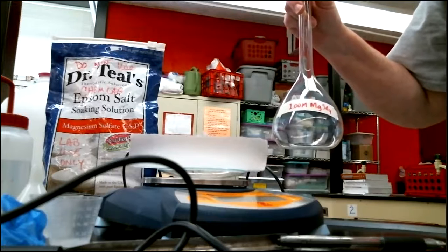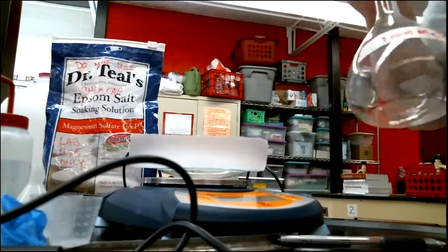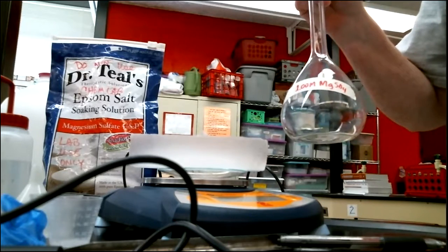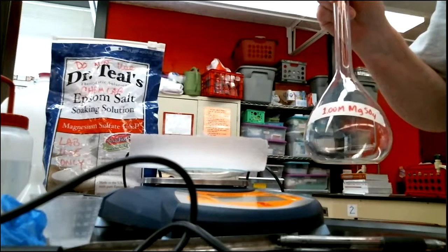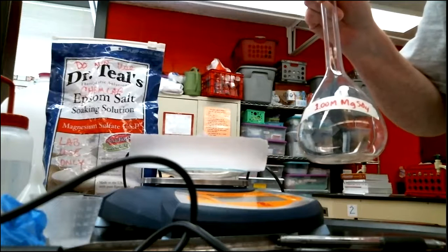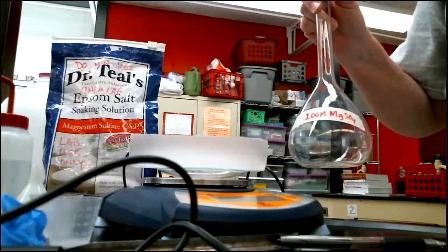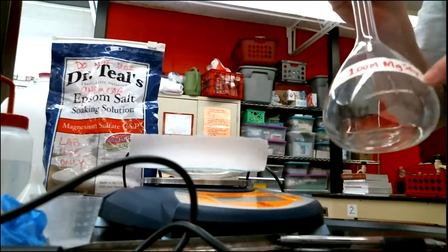So I don't want to put the whole 120 grams into this half a liter because it's only half as big. So in other situations, like if you had a 250 milliliter flask, you'd have to calculate how much do I need to put in there to have 1 mole per liter, because I only have 250 milliliters, not a full liter. A full liter is 1,000 milliliters. So this is half of a liter.